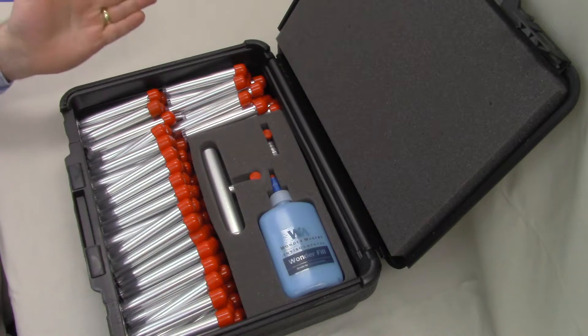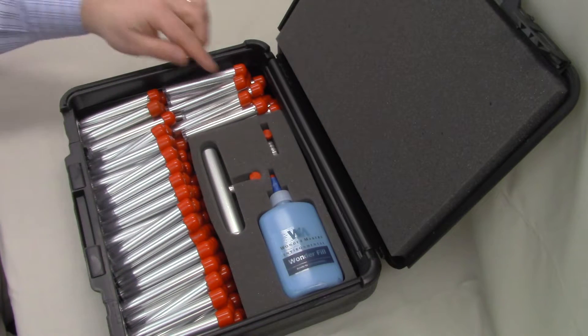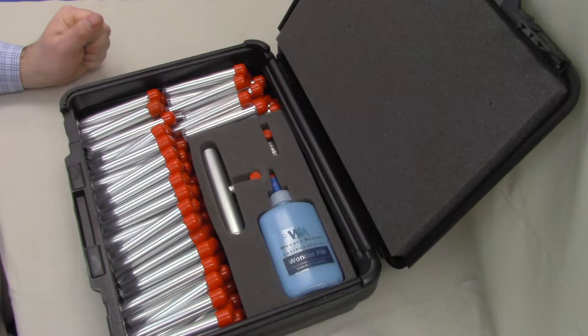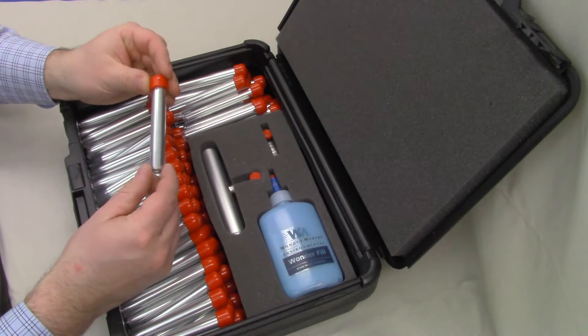Setting the brochure aside, we've got the actual contents of the case. We've got 100 cutter sleeves lined up along the side and the bottom here. We have a power driver, a handle, and Wonderfil. We're going to go through what these different components are. Let's start off by grabbing a cutter out and showing you how to open it and why we package them this way.